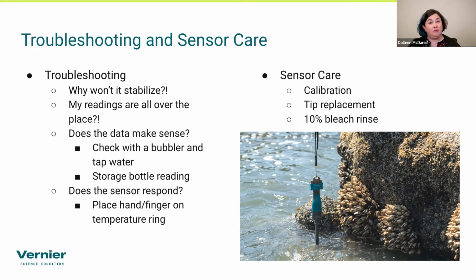Now, for calibration on the electrode version, you do want to calibrate that fairly often. If you're doing multiple readings in one week, I usually tell people calibrate it once, and then when you're done with your reading, keep the tip on with the electrochemical filling solution in there, and just keep it in a beaker of distilled water for that week. And then when you're done with it for the week, empty it, clean it out, things like that.